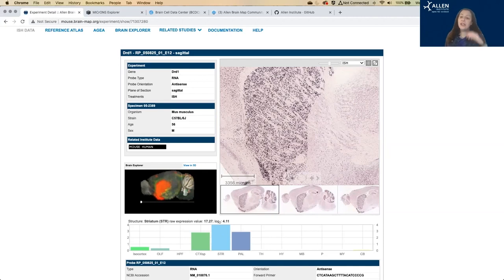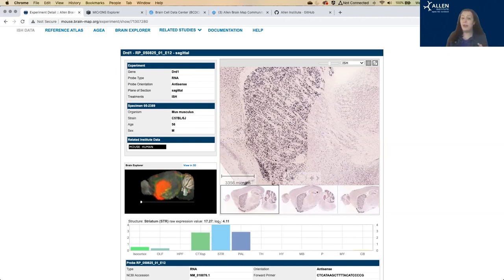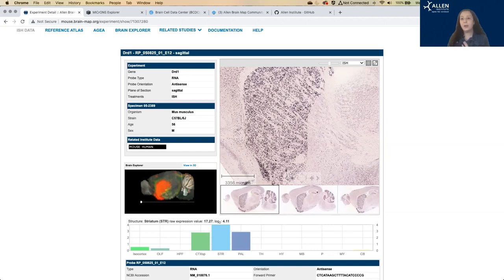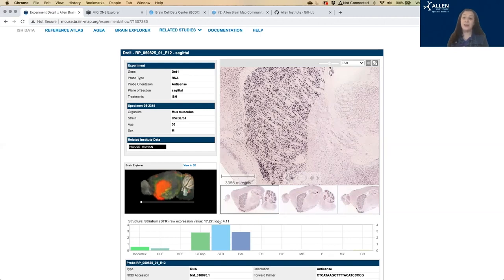Note that the ISH data is semi-quantitative due to the signal amplification process. And the intensity of the signal is not linearly correlated with the amount of transcript present. The gene expression should always be interpreted in relative terms and compare with caution across genes, because they go through the signal amplification process separately.